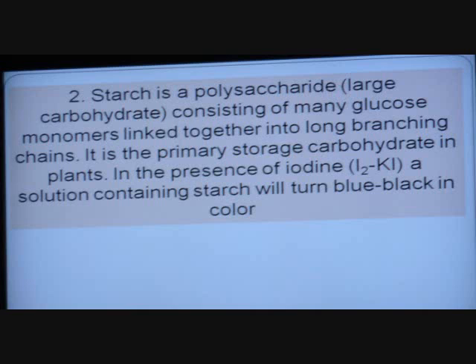And then you get that nice pretty stain like you saw on my paper towel. So if those paper towels back there, they'll do it too, I discovered. I don't need to buy anything fancy. I haven't tried it on my Piggly Wiggly paper sack yet. That would be the best of all, I would think. But you're looking for a dark blue-black type of reaction.